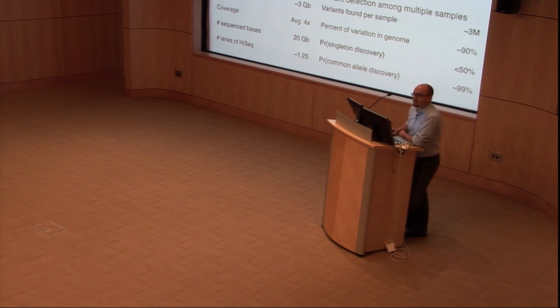In the annotation, when you report that, do you indicate the x coverage so that... It's available. It'll show up also in much better ascertainment in that sample. And also because of the way the multi-sample calling works, it actually projects better, improved sensitivity and specificity into the other samples even at lower coverage.